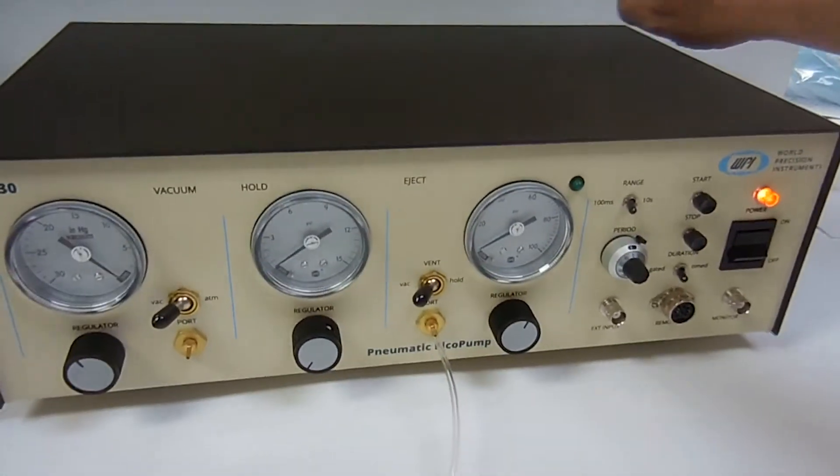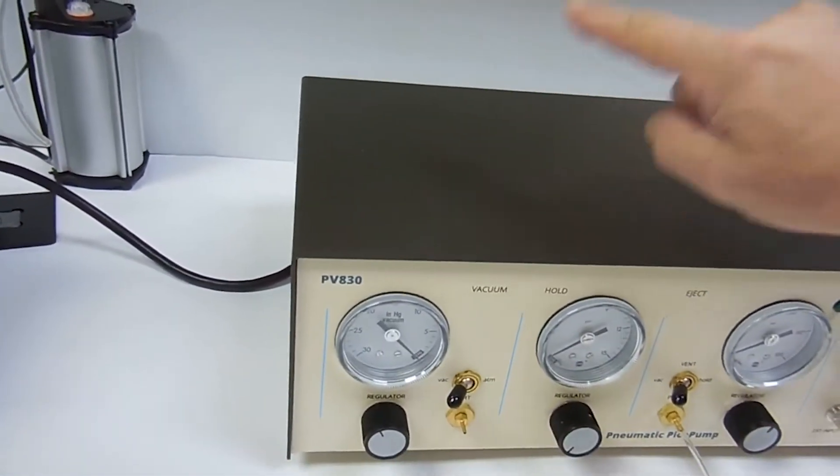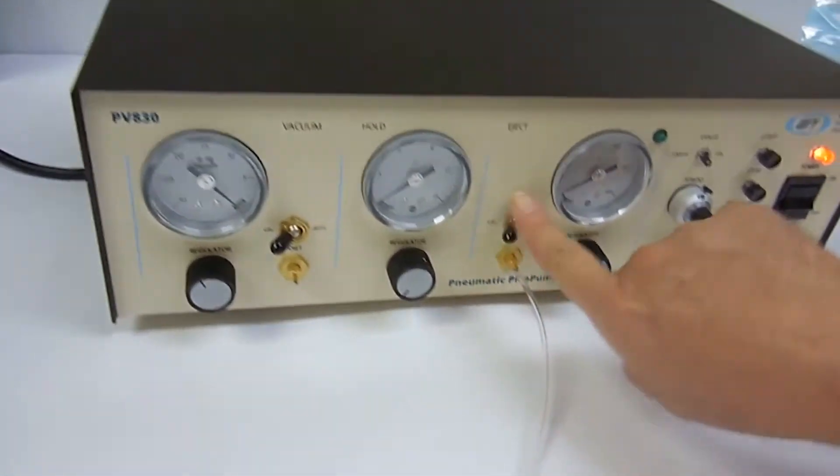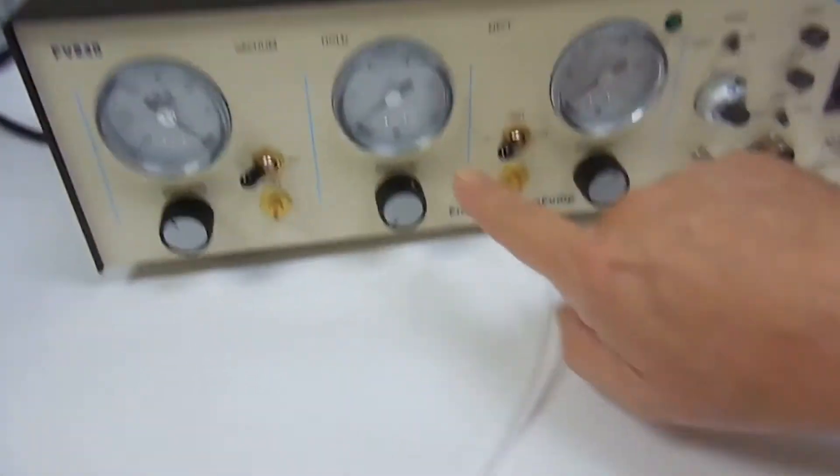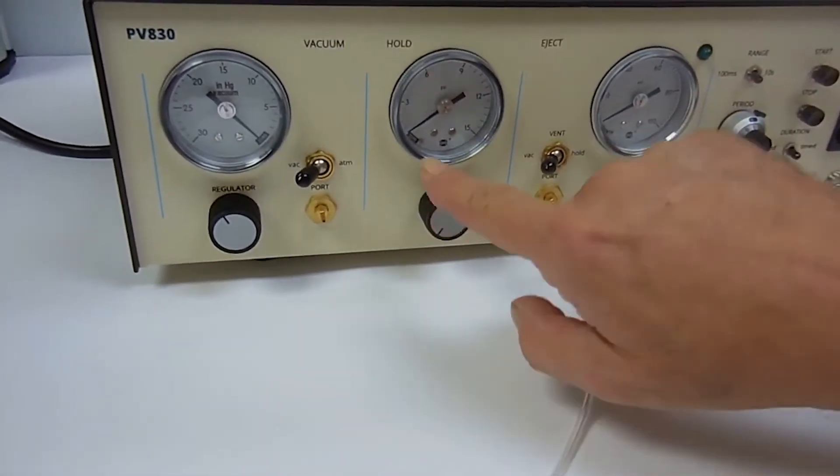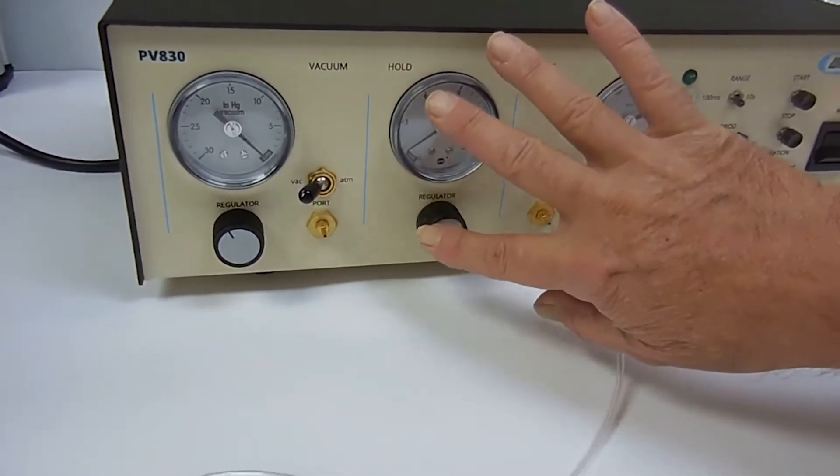Right now I've got 35 PSI coming in the back. I've got nothing connected to the vacuum source. I've got the vent switch in the vac position, there's a reason for this. I have a slight amount of pressure applied to hold but not enough to make a difference right now.